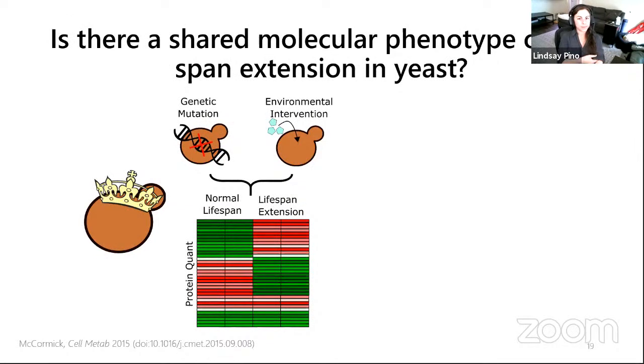Yeah, so in the context of biology, I had mentioned earlier how now we have these giant maps of looking at differential abundance as a molecular phenotype for different perturbations, different molecular subtypes.